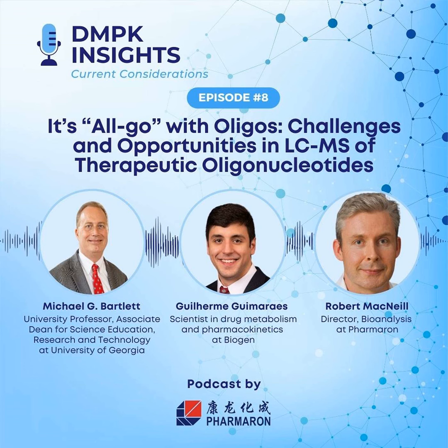Especially if you're going towards HILIC for oligos, you're sacrificing some of that selectivity on your chromatography. You could definitely make up for that loss with higher selectivity on your mass spec. We see some of these metabolites that deviate in mass by only 1 Dalton. We saw some work from Alnylam recently on deamination products, and how do you differentiate between these? Extremely hard to separate them chromatographically, right? So you do rely on the high resolution to be able to distinguish these species. So I think, especially from a biotransformation perspective, the high resolution from these instruments is huge, especially when looking at HILIC methods. It plays a very important role on that end for sure.